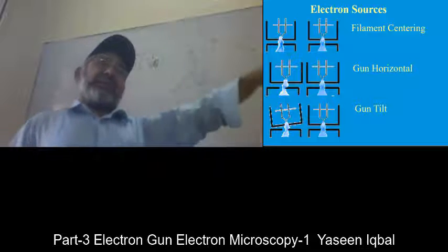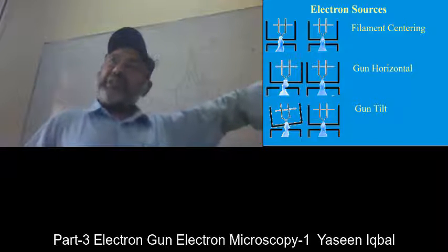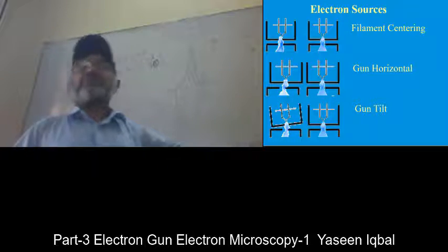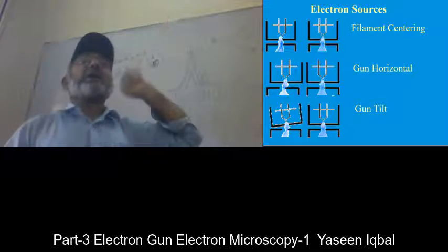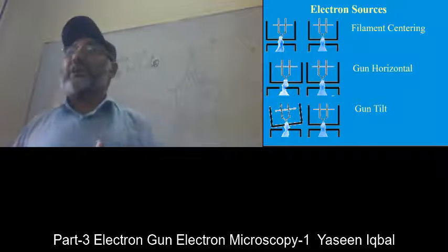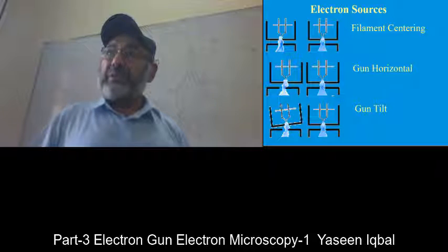If that fiber is on the sample holder of the electron microscope and it enters the machine, then the vacuum will be destroyed and the machine will stop working. And you will have to start from the start again. So when you are being authorized to work in such sensitive labs, you must be extraordinary in your care and your intelligence and your smartness that nothing is damaged.